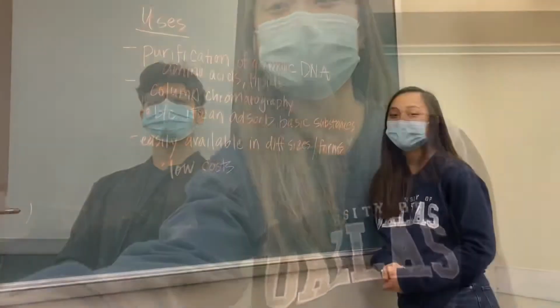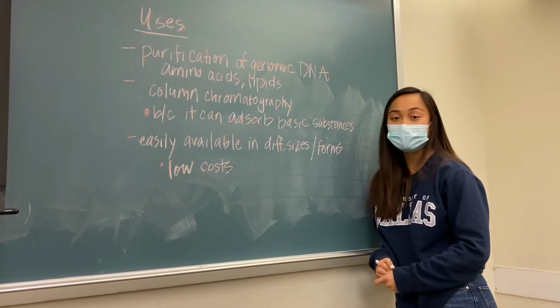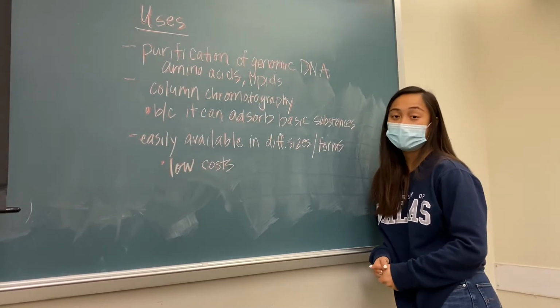And today we'll be talking to you about silica column purification. Silica gel is used in column chromatography because it can adsorb basic substances that are within a material that have to be purified or separated. So what is it used for?